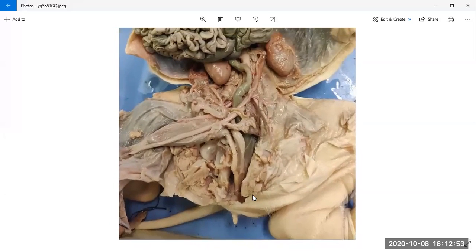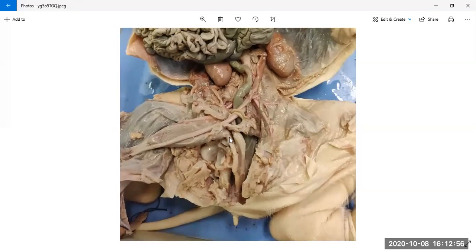Yeah, I think I've seen this one. This is the urethra, and this should be related to the penis. Yeah, maybe not. This looks like a female pig. Okay, just know that this one is the rectum. These two, I cannot tell what they are, but this one I'm sure is definitely the urethra. This one I cannot be sure. It could be related to the female reproductive organ.